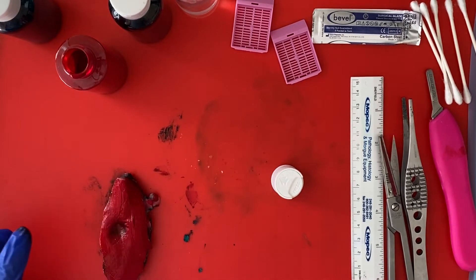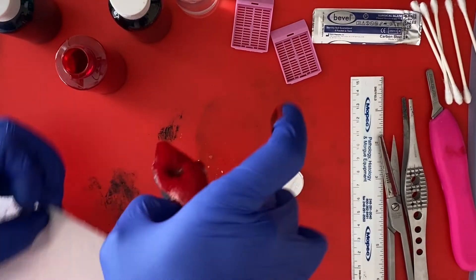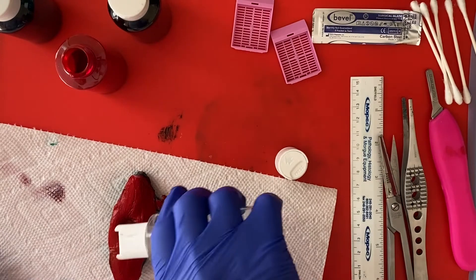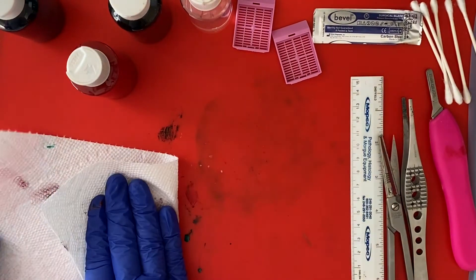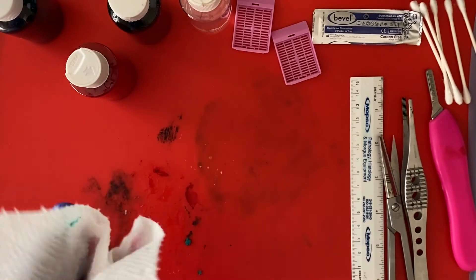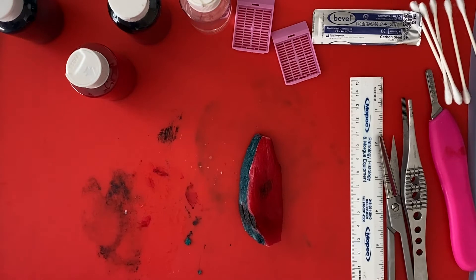Now I'm going to get a paper towel and put on my mordant. I'm going to mordant off this thyroid lobe. Green is anterior, red is posterior, black is the isthmus margin. I'm going to change my gloves because they're nice and inky.